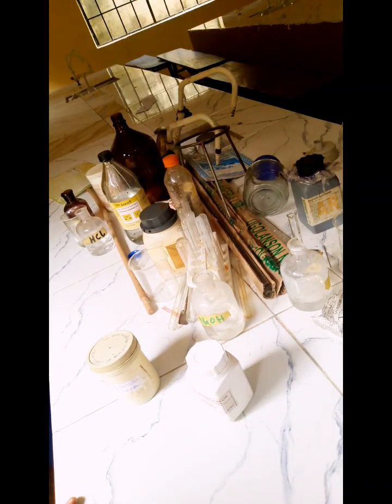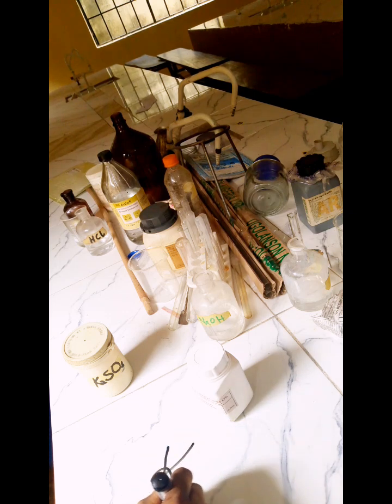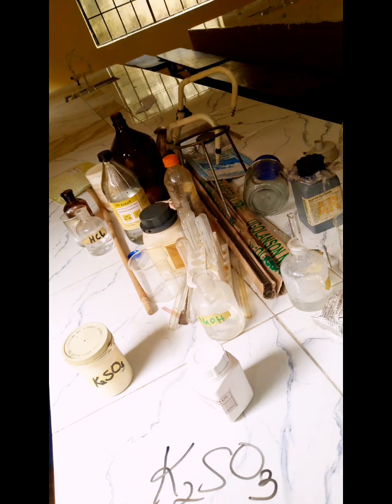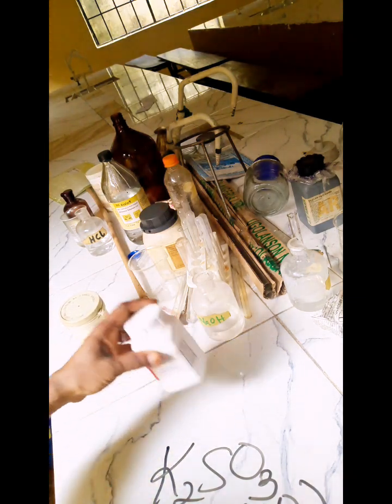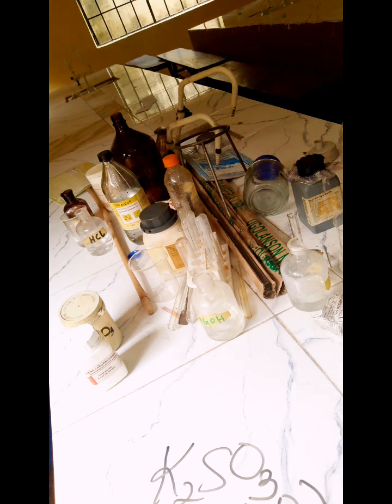We want to do salt analysis for the 2025 NECO protocol. The salts for this year to analyze are potassium sulfite and lead nitrate. These are the two salts given by NECO in 2025 for analysis.